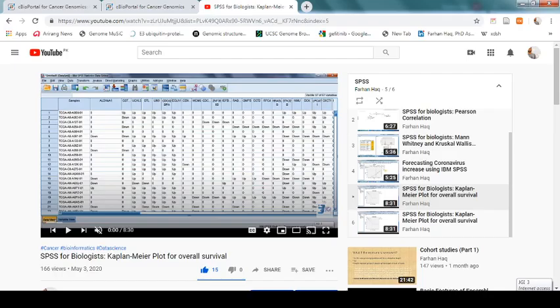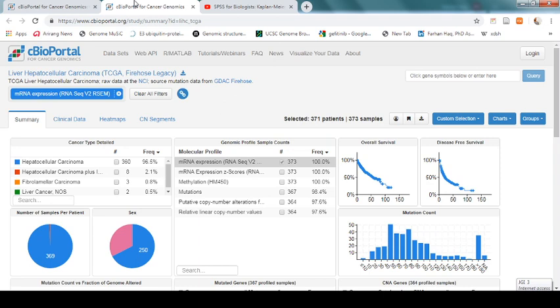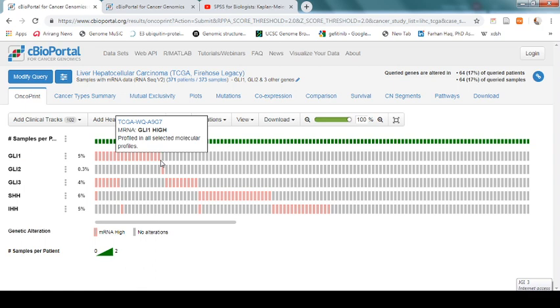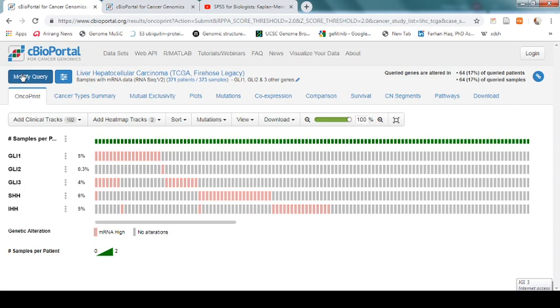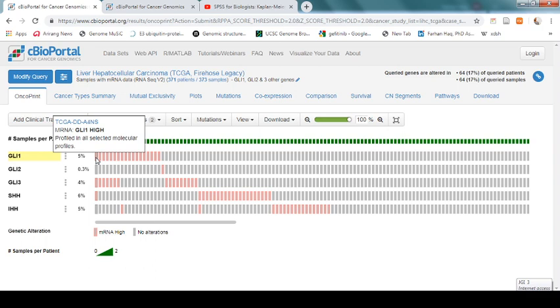So I think now you have a good idea about how to download the information of cancer genomics and transcriptomics from cBioPortal. I have used an example of liver cancer, selected the mRNA expression dataset, and the dataset contains 373 patients. Using this OncoPrint method, we have discussed different values: which gene shows the highest frequency of expression, which gene showed the lowest frequency of expression, which gene showed mutual exclusivity and co-occurrence, and which gene showed association with survival. If you want to check the association of one gene at a time, you just modify the query, delete the rest of the genes, and submit — for example looking at only Gli1.